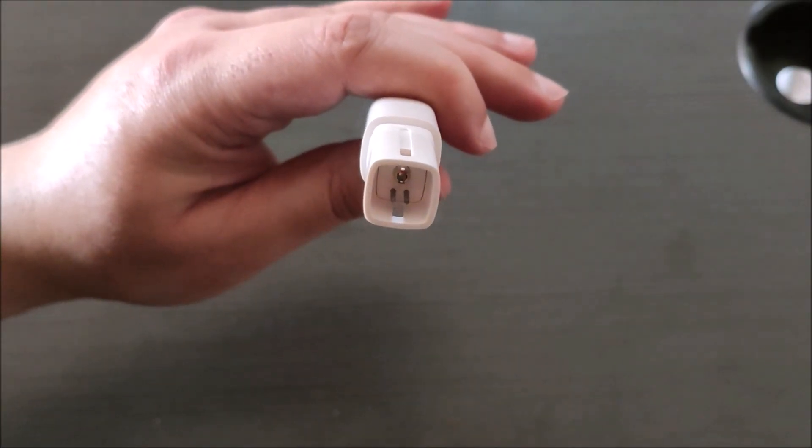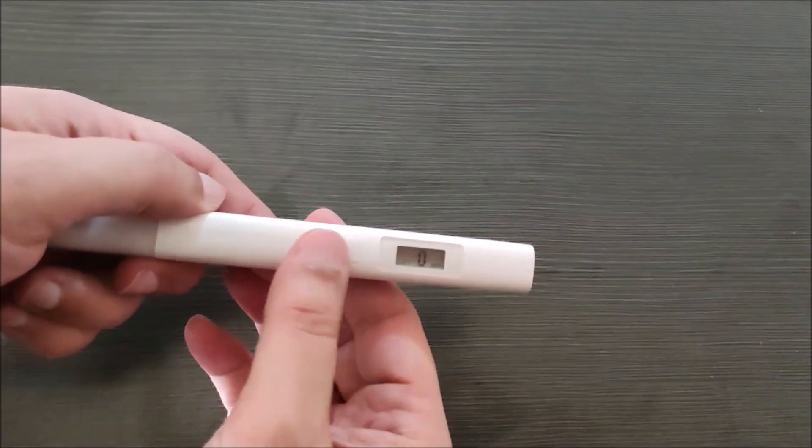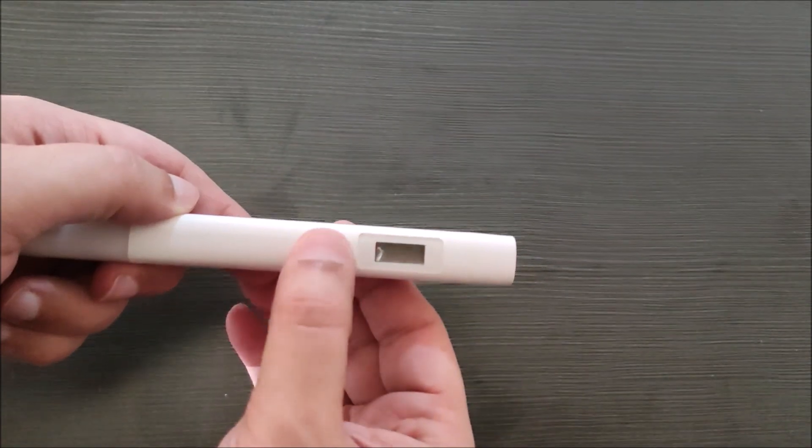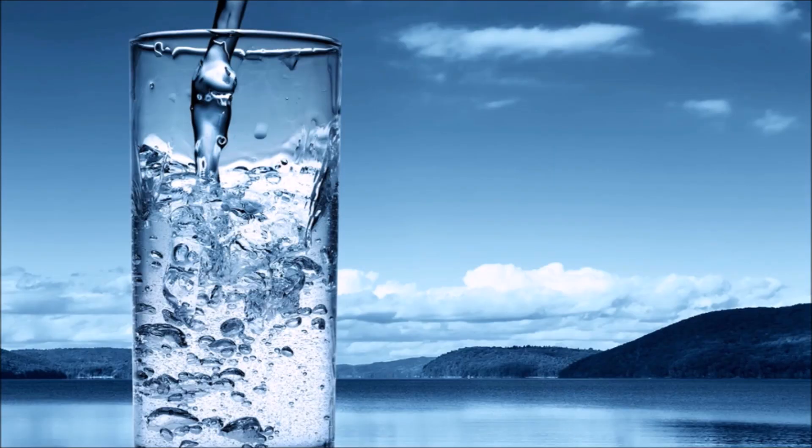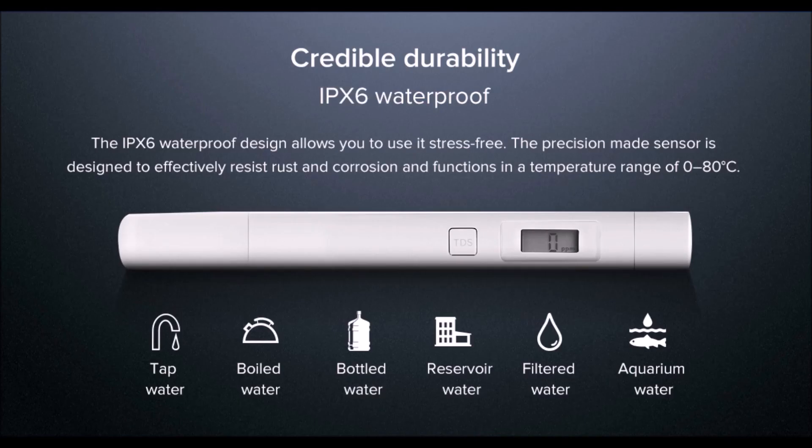There is a Titanium TDS probe which we dip in water for testing. The button is for on or off, and there is also an auto-off feature. You can test various sources of water like tap water, boiled water, bottled water, filtered water, reservoir water, and aquarium water.